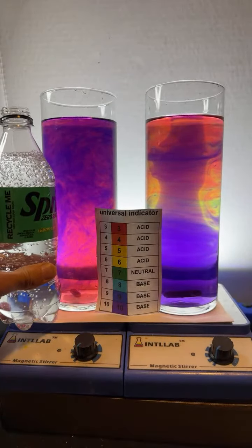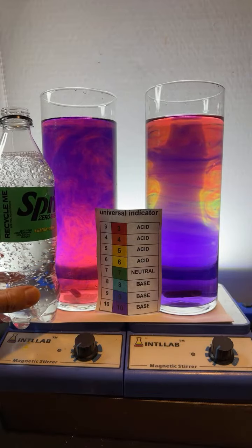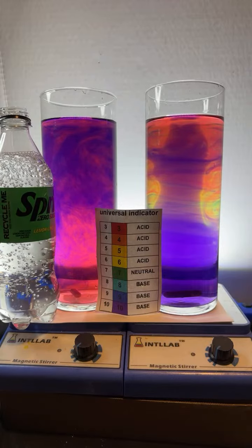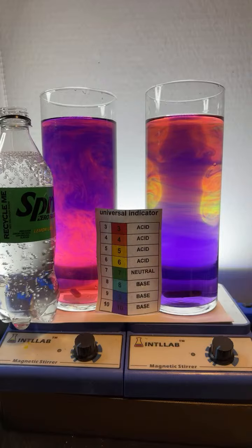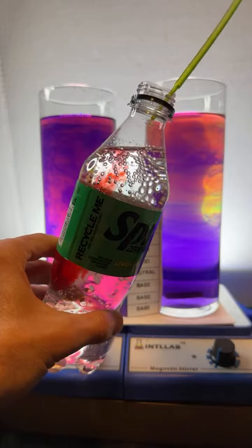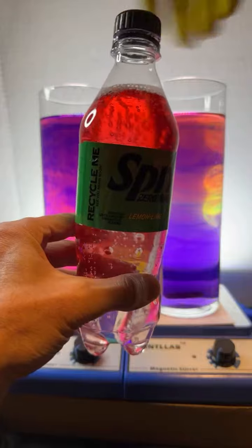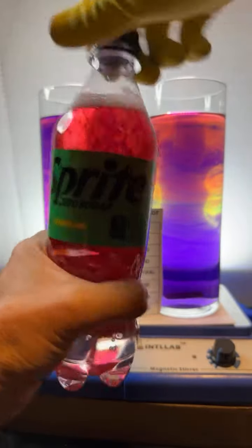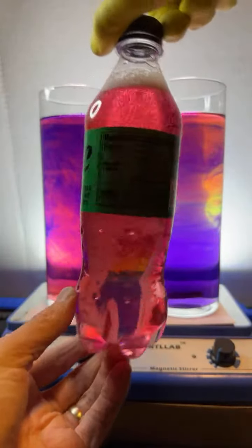Let me just stick that right there. Don't fall. Don't fall. If that falls, I'm not going to be happy. Okay. All right, here we go. In goes the squirt. Look how red that stuff is. That's exactly what I'd expect. Of course, there's a bunch of acid in here. A ton of acid. Let's shake that up. And you can see that red color go all the way through the Sprite.